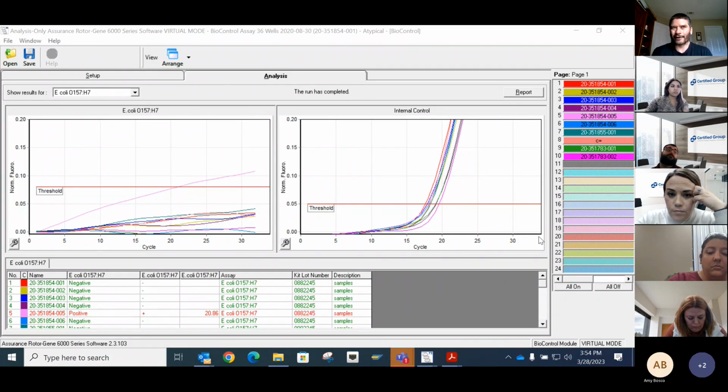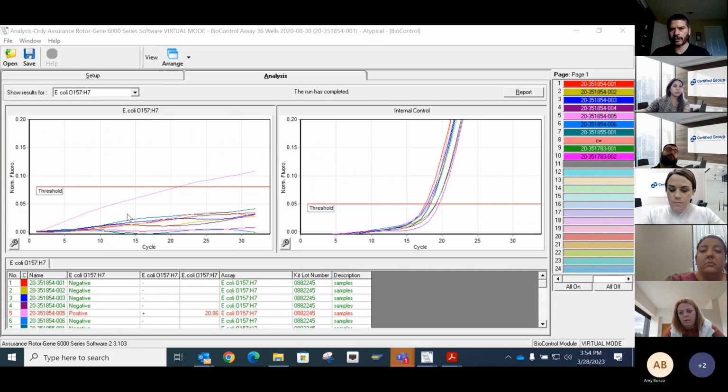Positives in general are not very typical themselves, right? There are very low level positives, which is obviously good for the customer, and it doesn't have any bearing on any other positive or negative sample. Those are always isolated to those individual tubes when you get a result like this. If there were any other positives in the run, those stand on their own, just like these negatives do.